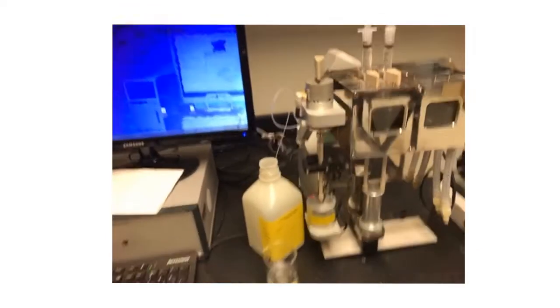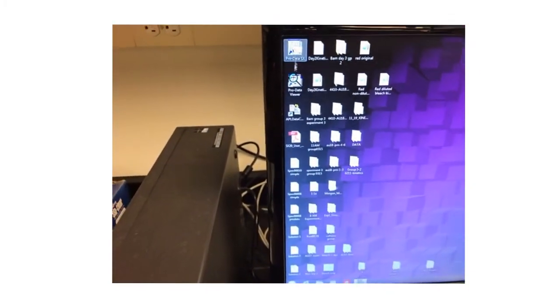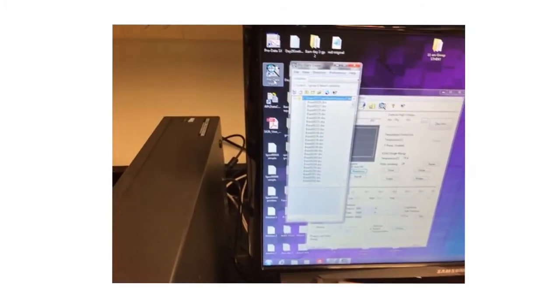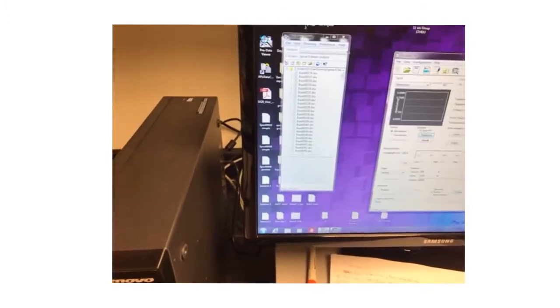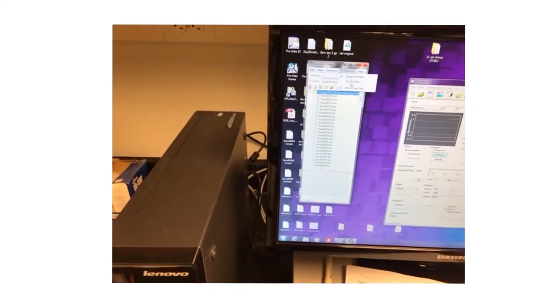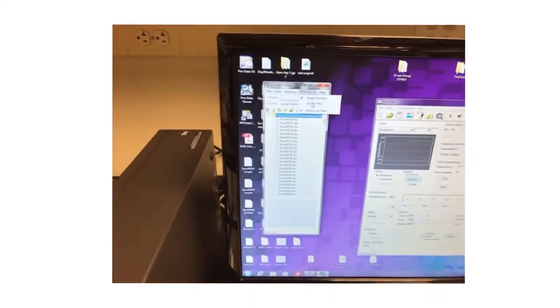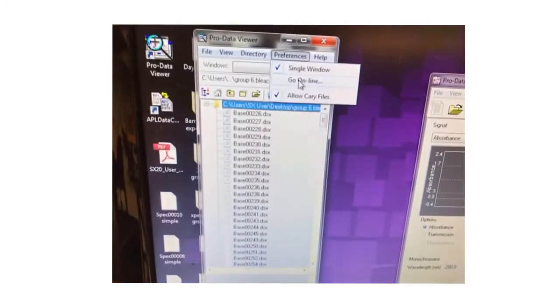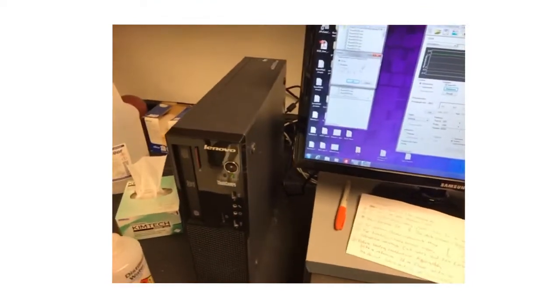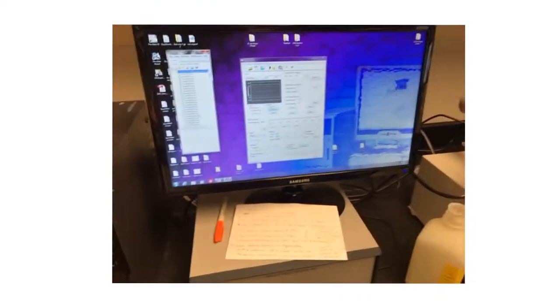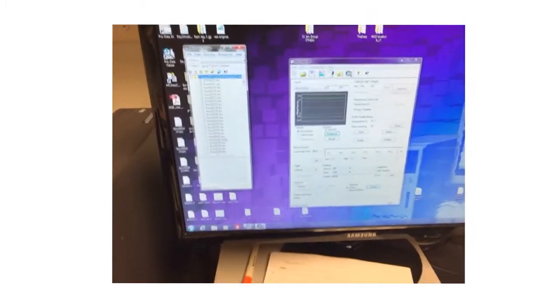So there's two ways we can power this mechanism. One of those is using software. So let's mention the software real quick. So to get the software going, we'd want to click on the ProData SX. Then we'll click on the data viewer as well. One key thing here, usually we do all this before you get in here, but who knows what life's going to be like this semester. But we just click this go online button. If you can see here, the preferences go online. That allows any of the files we generate with our software to be saved onto the hard drive computer. It's a pretty important step.